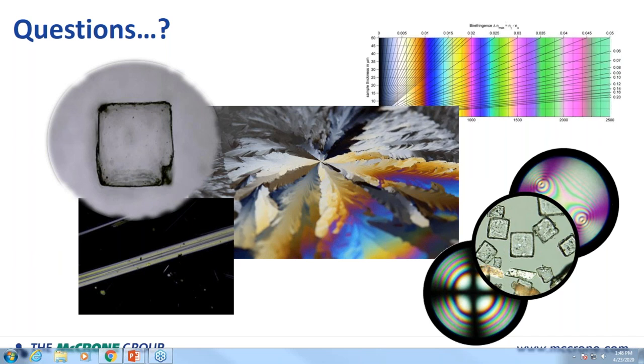Here's a question for you, Tom. Can you use polarized light microscopy for a biological sample? Absolutely. All we're looking at is crystalline structure. And then we define crystals differently than a lot of people do. A crystal to me is just something with a repeating chemical structure, a solid with a repeating chemical structure. Hair, keratin, it is crystalline in nature. Bones can be crystalline in nature.